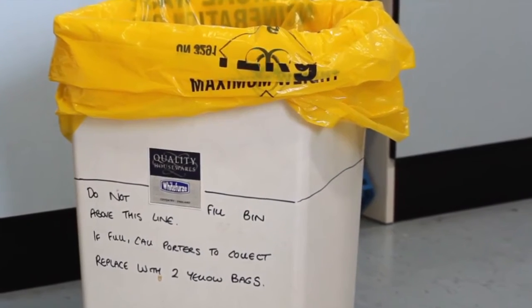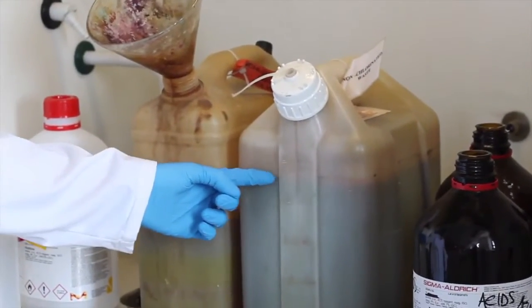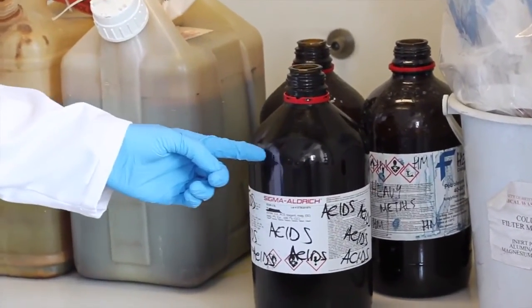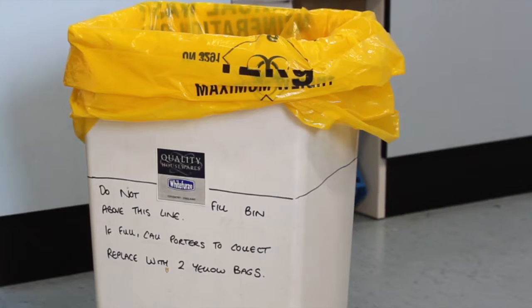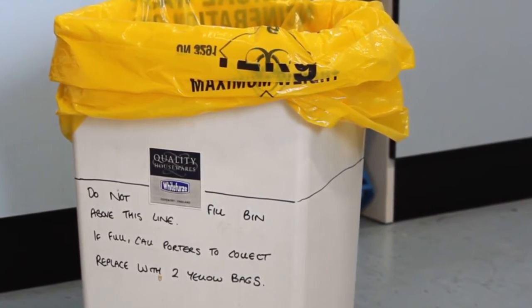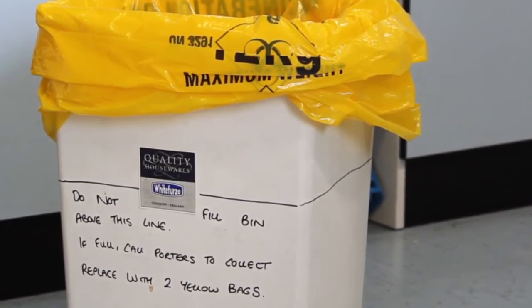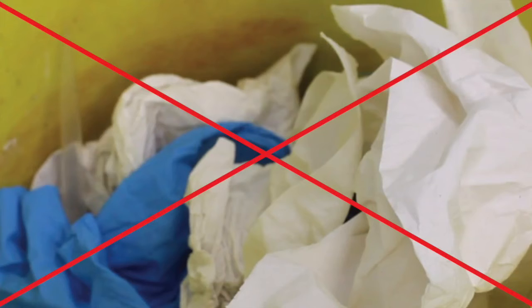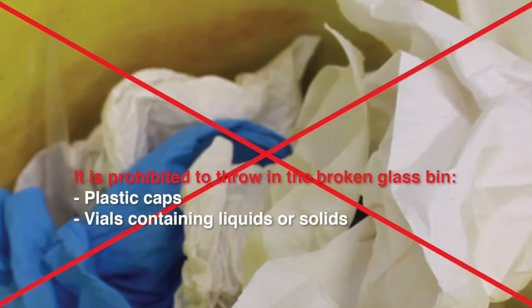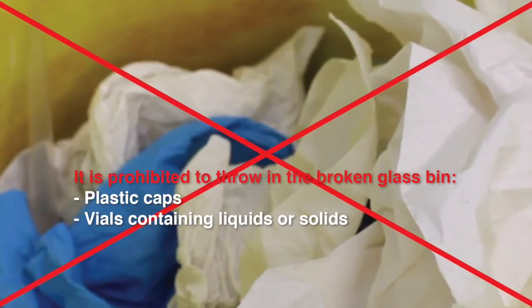Please make sure that you don't fill the glass bin up to the brim. Every container has a black mark at around 75% of the volume, which highlights its maximum capacity. As soon as the waste inside reaches the mark, please contact the porters of the School of Chemistry. They will come, dispose of the full bag of broken glassware, and replace it. Furthermore, it is prohibited to throw anything into the glass bin which is not made of glass, such as plastic caps and vials containing liquids or solids.